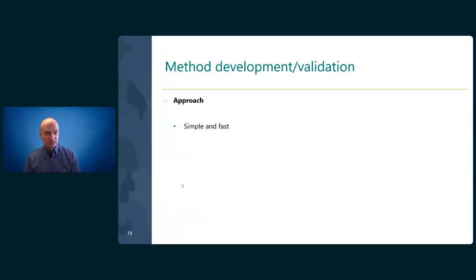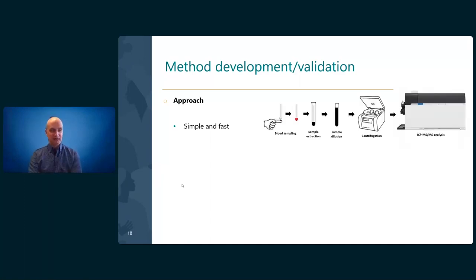Let me bring you to the method development and validation. We thought that the approach has to be simple and easy, right? So for that reason, we imagined that the workflow would be just collecting the sample, blood sampling, extracting the analytes, diluting if necessary, and then analyzing on the ICP-MS.